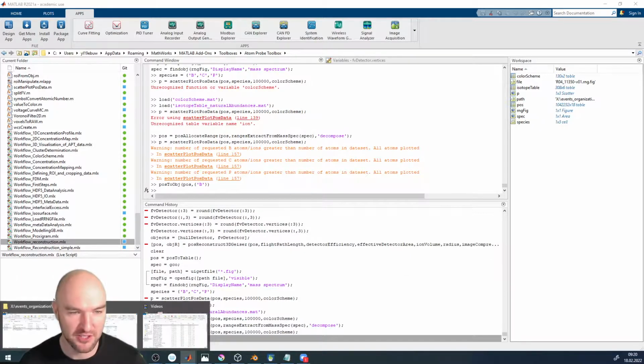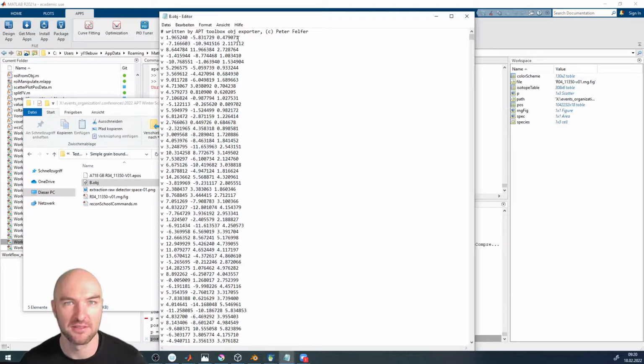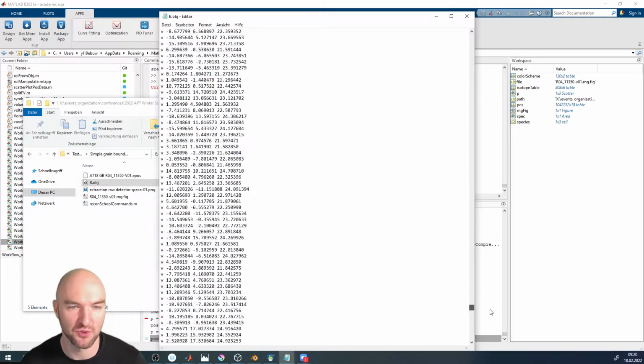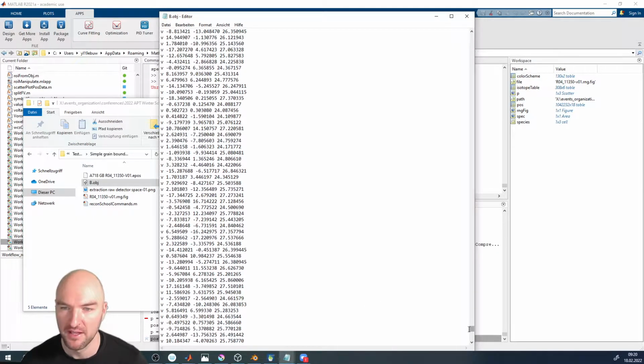And then, just like I showed you yesterday, this is a text file. So we can open that with a text editor, and you'll see a lot of V's. If you scroll to the end, you don't see any F's, because of course there are no faces per se. We're just exporting vertices.